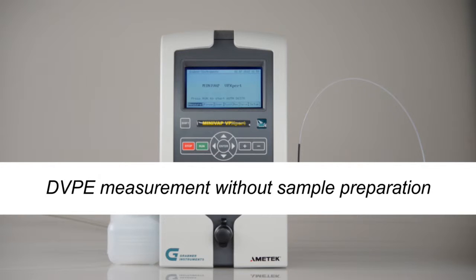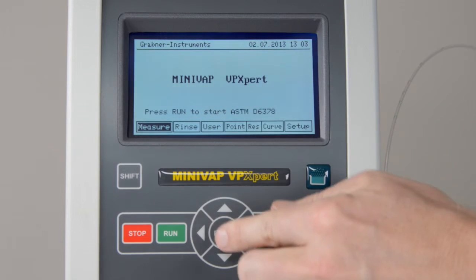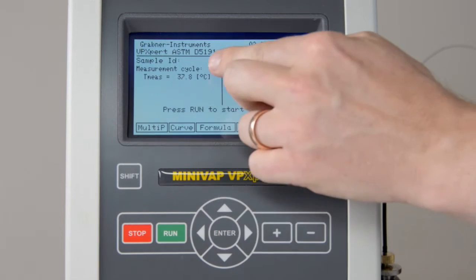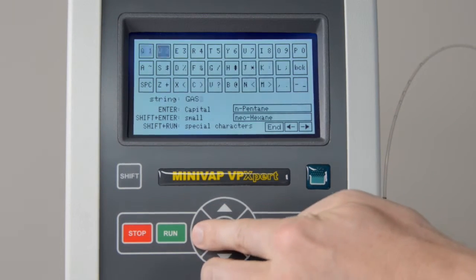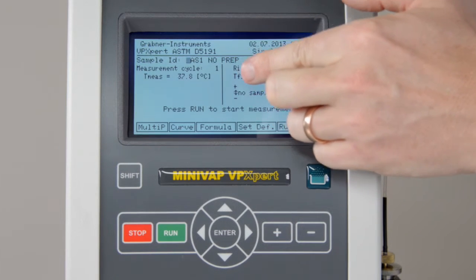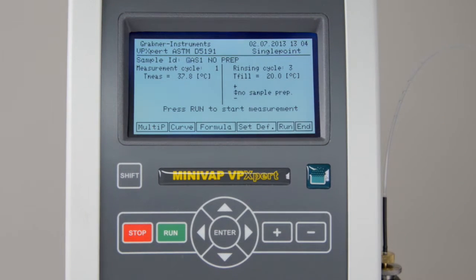DVPE measurement without sample preparation. This method is a D6378 measurement. The result is automatically corrected by an ASTM proven formula to show the D5191 DVPE. Select ASTM D5191 through the measurement menu. Insert the sample ID. Check that the rinsing cycles are set to 3, the measuring temperature is set to 37.8 degrees Celsius, the filling temperature is set to 20 degrees Celsius, and that no sample prep is selected.